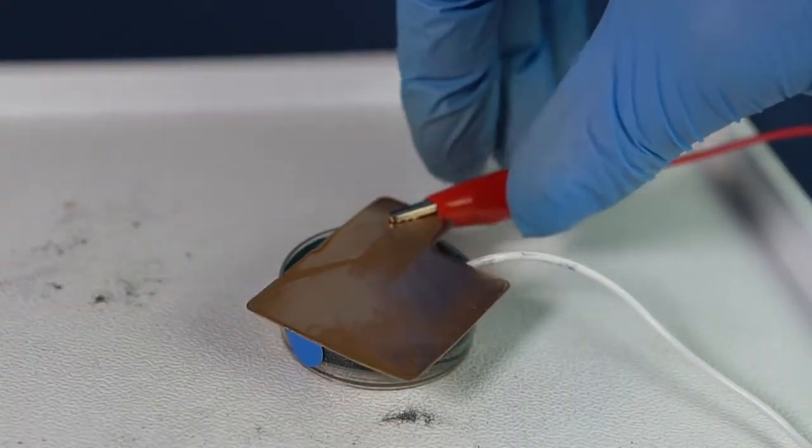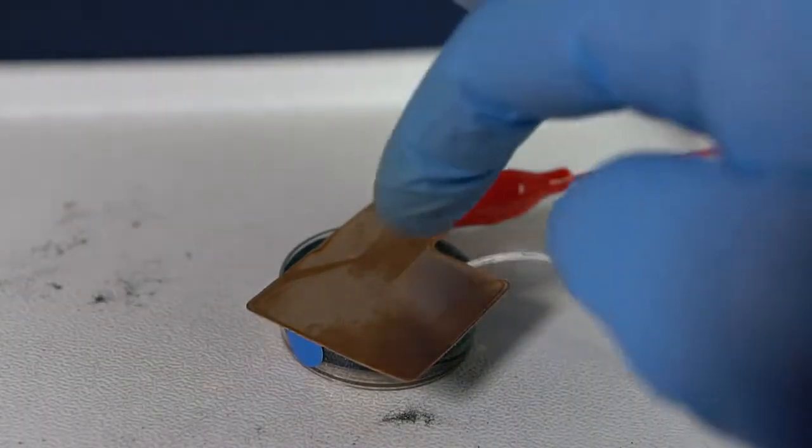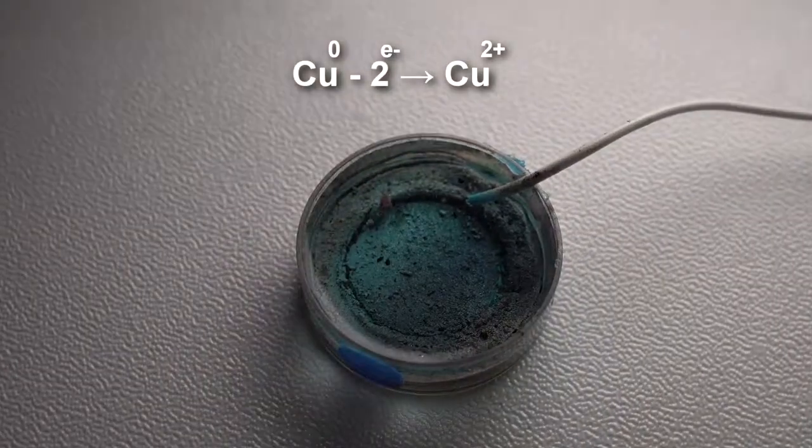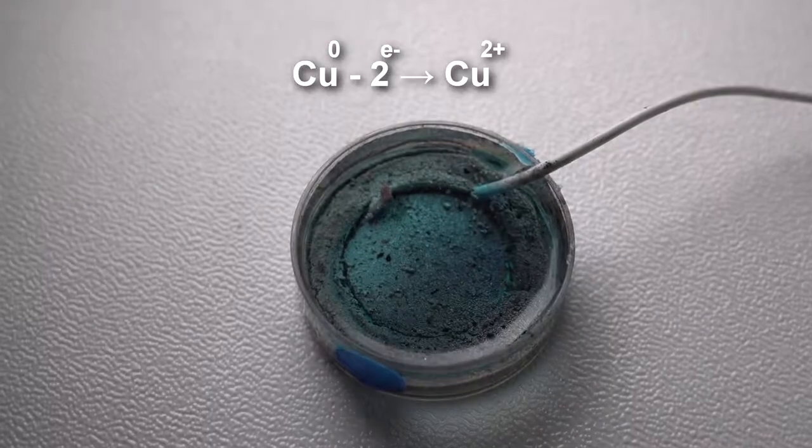The part with electron shortage will be the copper plate in this experiment. Therefore, a reverse reaction happens on the copper plate. Copper atoms lose two electrons, turning into copper ions, and get into the solution.